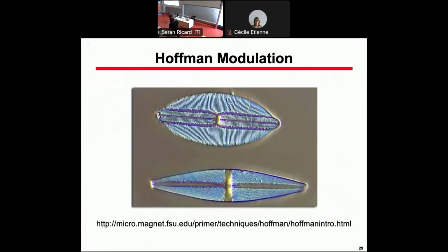The images are quite easy to recognize because now we are not on the white screen. It's not a dark field, it's a gray field. There is no sample, it's exactly absolute, so it's gray. Wherever you have a sample, in some places there are more luminous parts or darker parts. Here it's the white lights in terms of color.